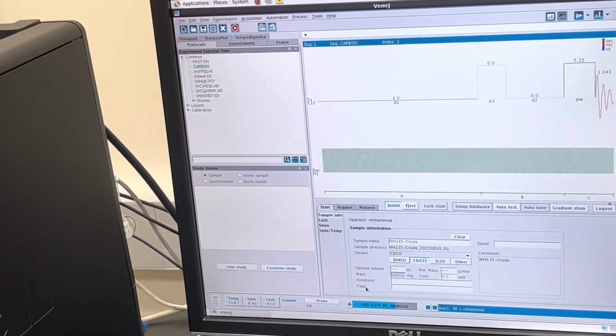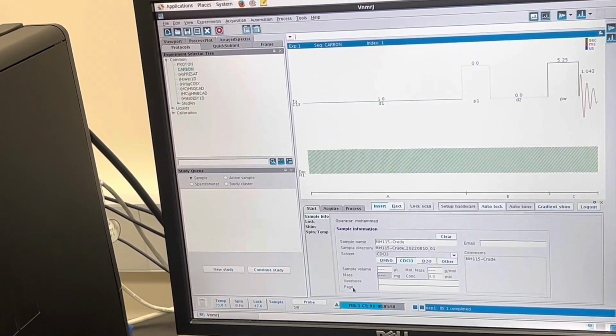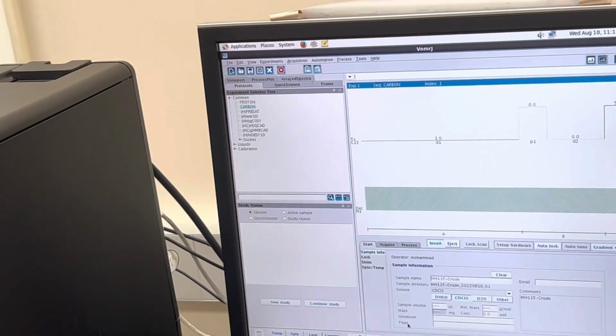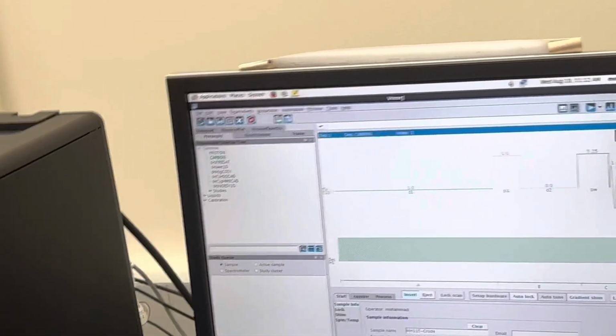He is saying that if your proton was good, with the shimming and locking, then you can be assured that your carbon will also be good, because it will use the same data, same shimming, same thing.